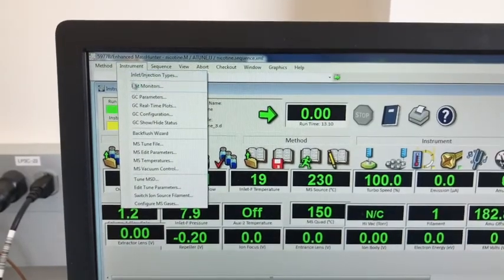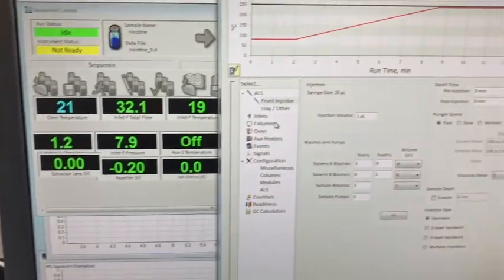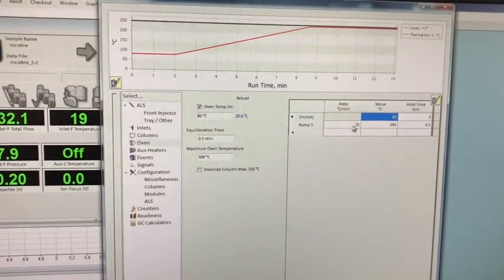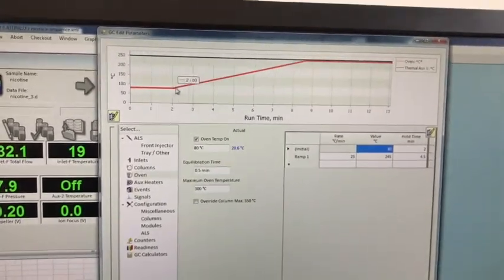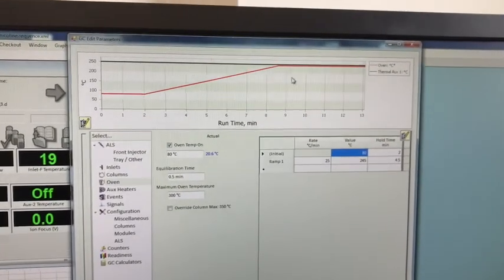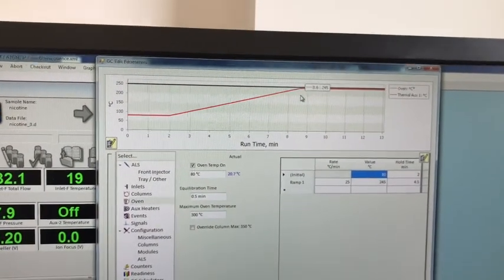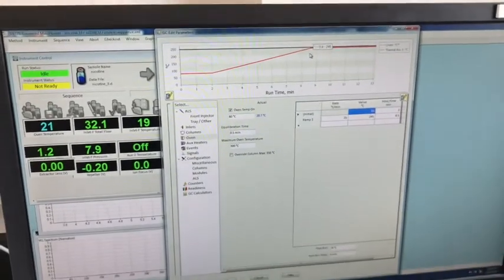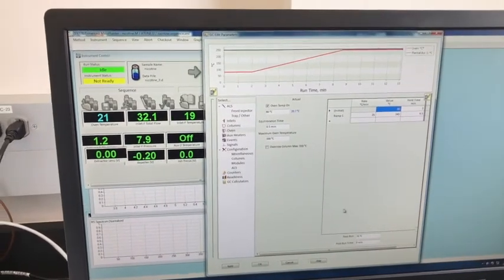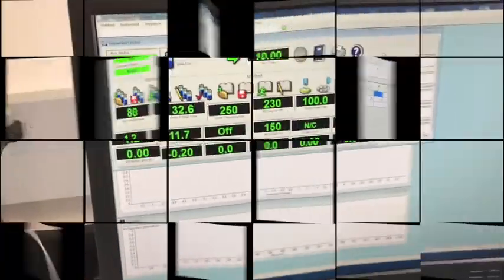In the meantime, we can see how our GC run is set up. We go to Instrument GC Parameters. For this run, for two minutes we are at 80 degrees Celsius, then at a rate of 25 degrees Celsius per minute we ramp up all the way to 245 degrees Celsius, and we hold that for another four and a half minutes. That temperature program will help us separate out nicotine and quinoline, as well as any other components in the sample.